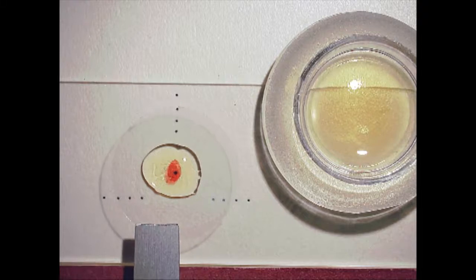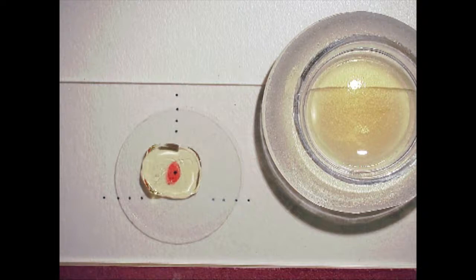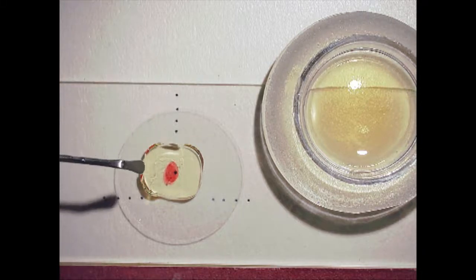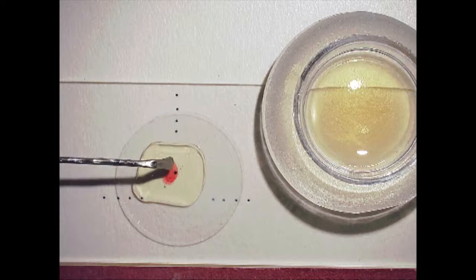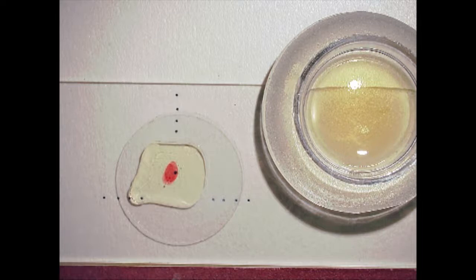This is the trickiest part, trying to place that cover slip center on the specimen with equal pressure. There I put the cover slip down, and you'll see the balsam starting to move out with the surface tension. Sometimes you'll need to get a probe again and use a little bit of pressure right on your specimen, gently tap. And so much of this is dependent upon the viscosity of the balsam. You can see the balsam now is moving underneath that slide.